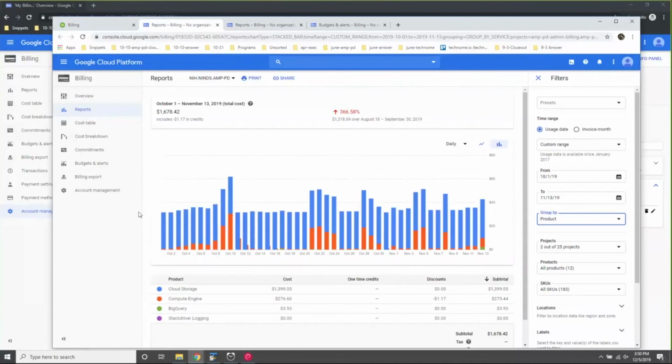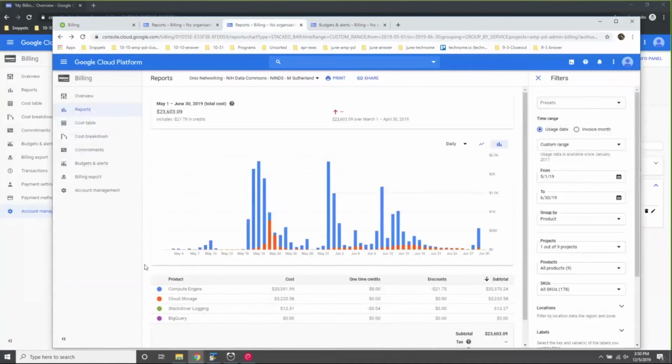But in this tab, I'm showing where we ran very expensive processing. So here you're seeing AMP PD's time from May to the end of June, when we did a whole lot of RNA-seq processing through salmon and feature counts and star alignments. That was a pretty expensive process, and we ran those all in Terra. We also did our joint genotyping for 4,000 whole genome sequence processed CRAMs.